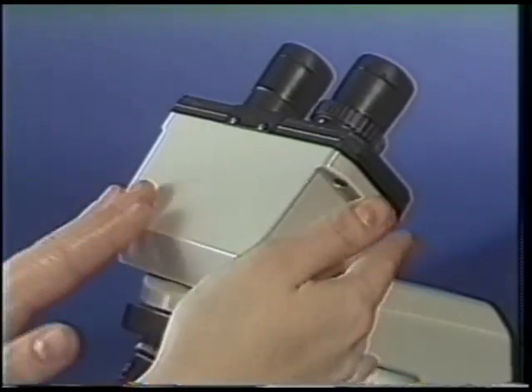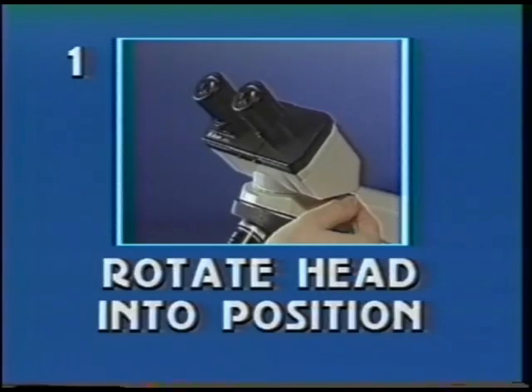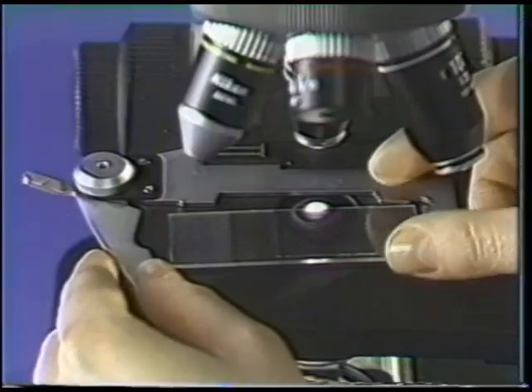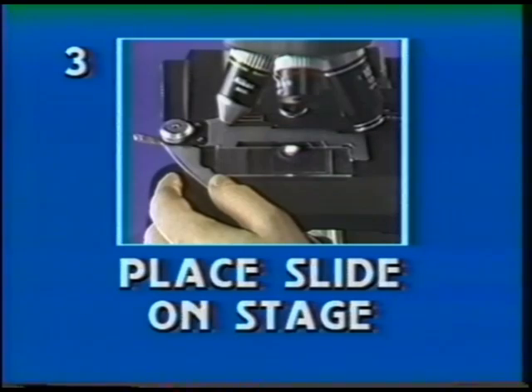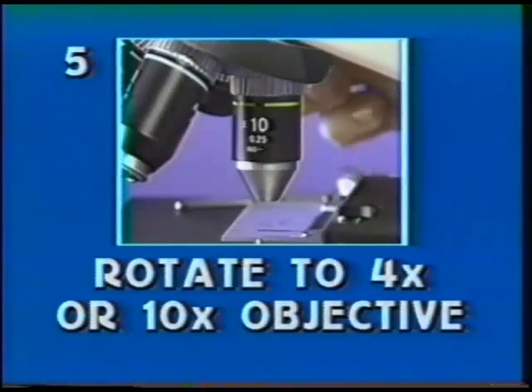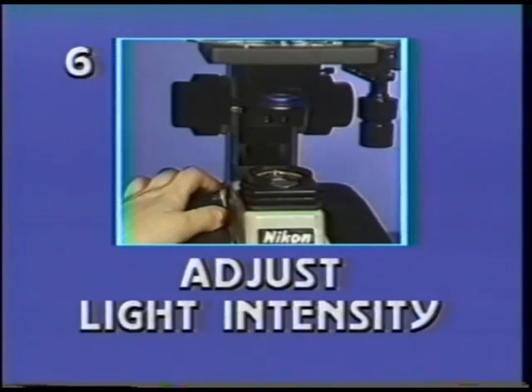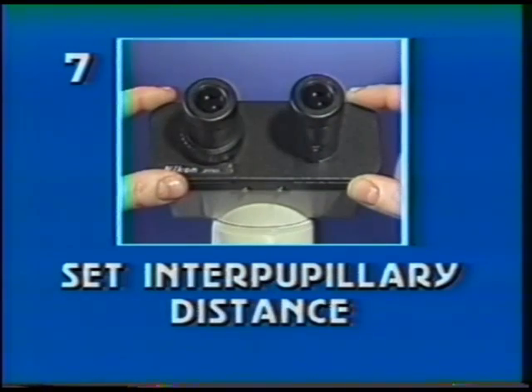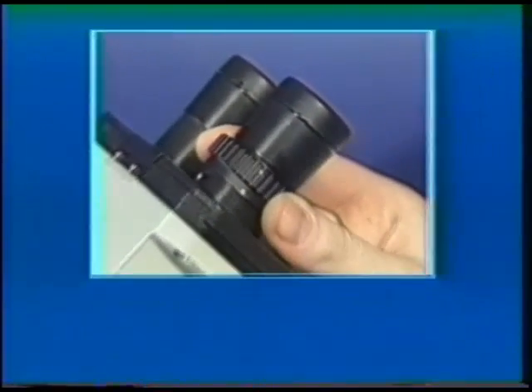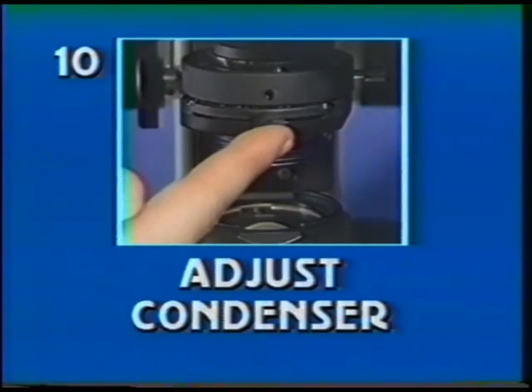In review, these are the steps to operate the AlphaFoT II microscope: 1) Rotate the head into viewing position. 2) Plug in the power cord and turn the microscope on. 3) Place the slide on the microscope stage. 4) Move the specimen into the light path. 5) Rotate to the 4X or 10X objective. 6) Adjust the light intensity. 7) Set the interpupillary distance. 8) Bring the image into sharp focus. 9) Adjust the diopter setting with the left eyepiece. 10) Adjust the condenser diaphragm.